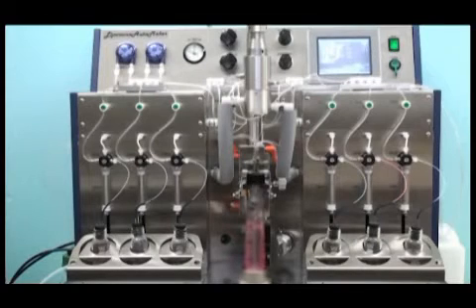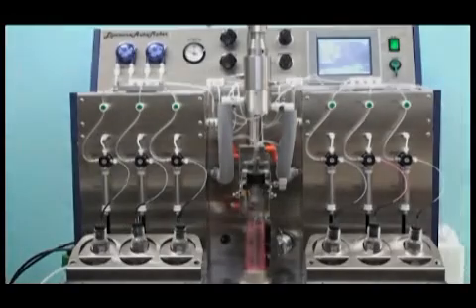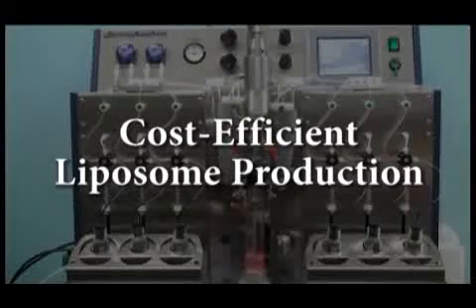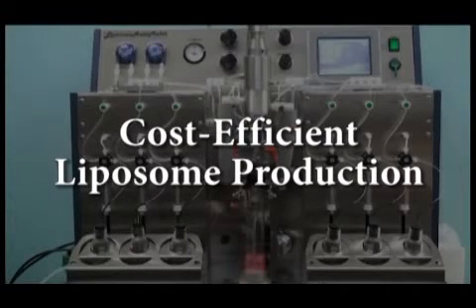Reducing research time and costs, the automaker requires simple one-touch operation to produce any type of liposome automatically, quickly, and repeatedly.